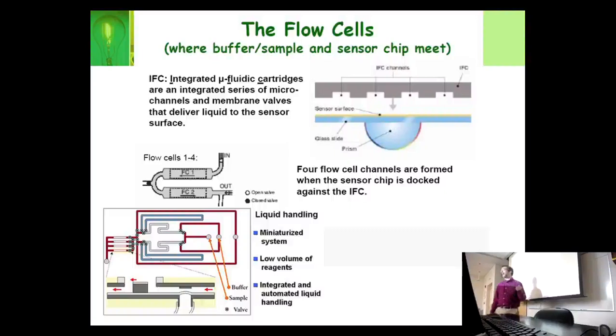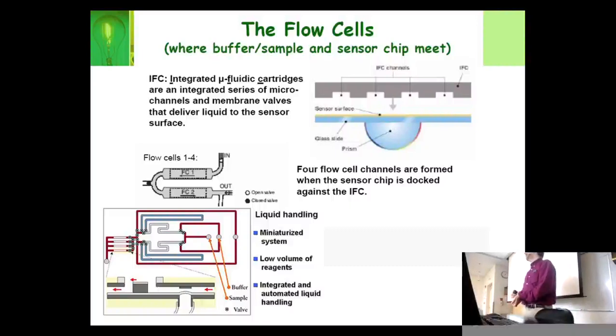You expect something pneumatic. There's going to be an air compressor, and we are going to be using compressed air. But you don't actually touch any of this. The computer controls all of this, and it moves stuff through the different flow cells. It's very small, so you're going to be using just a minimal amount of reagents. It's a really nice technique for that.